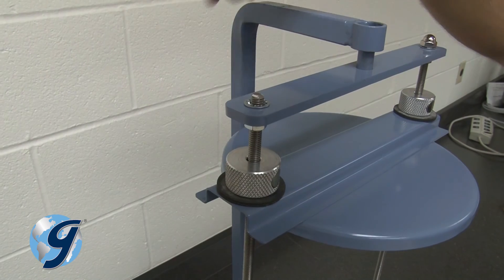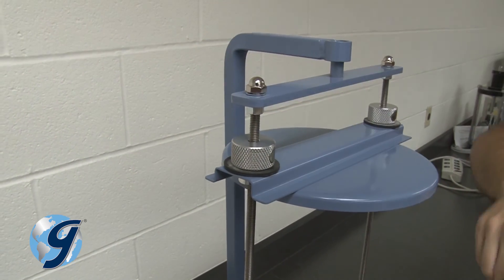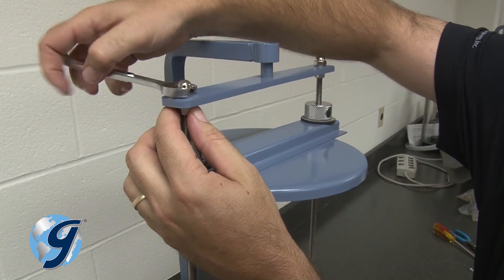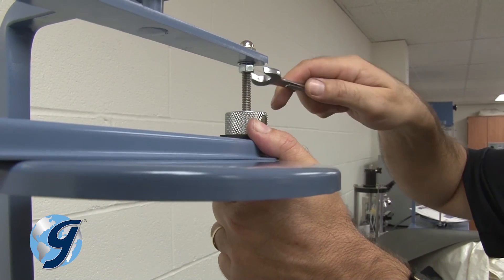Next, place a lock washer and an acorn nut on top of both sieve retaining rods and tighten. Now tighten the two hex nuts until the sieve retaining frame is secured.